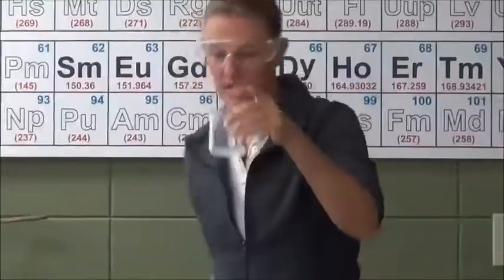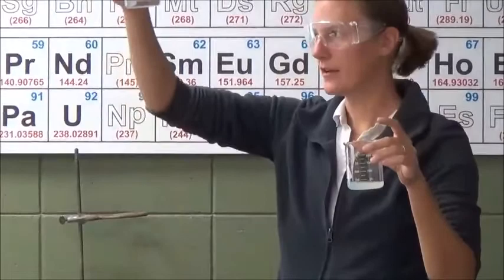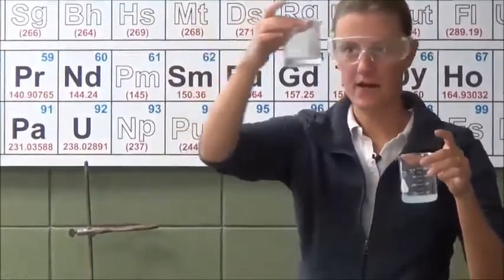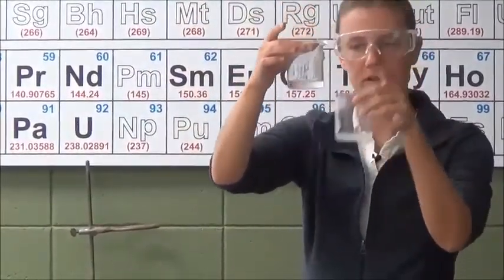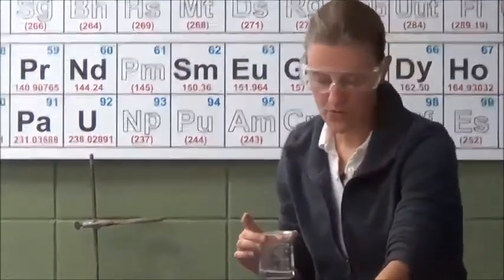Now, as far as right now, it looks a little cloudy. Here's the one I did yesterday. You can see, and I'll walk around, that the solid particles I've made have fallen to the bottom. So right now it looks just cloudy, but over time the solid would sort of separate out.